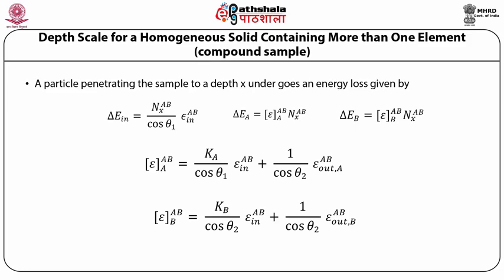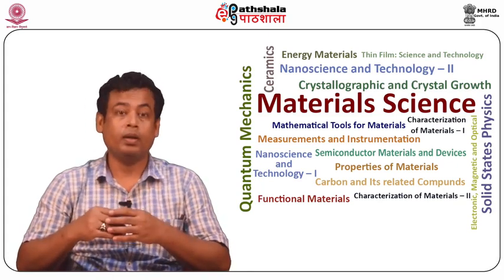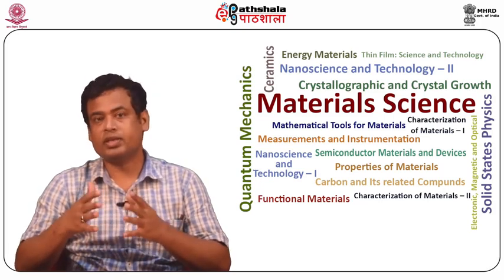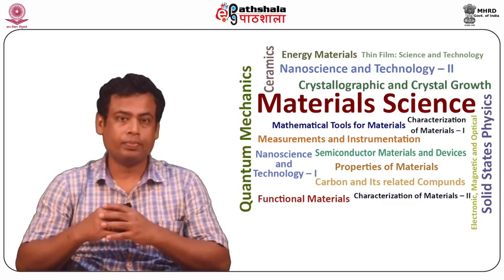So students, let us summarize what we have learned in this module. In this section, we gained knowledge of depth scale analysis with the help of the energy of the detected particle.